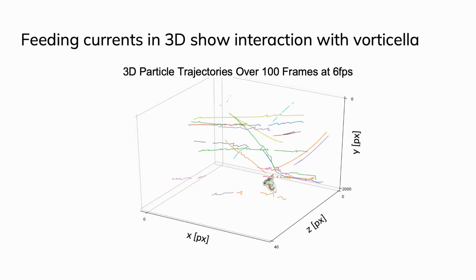In 3 dimensions, we see similar behavior, along with particle motion along depth. These behaviors need to still be further investigated.